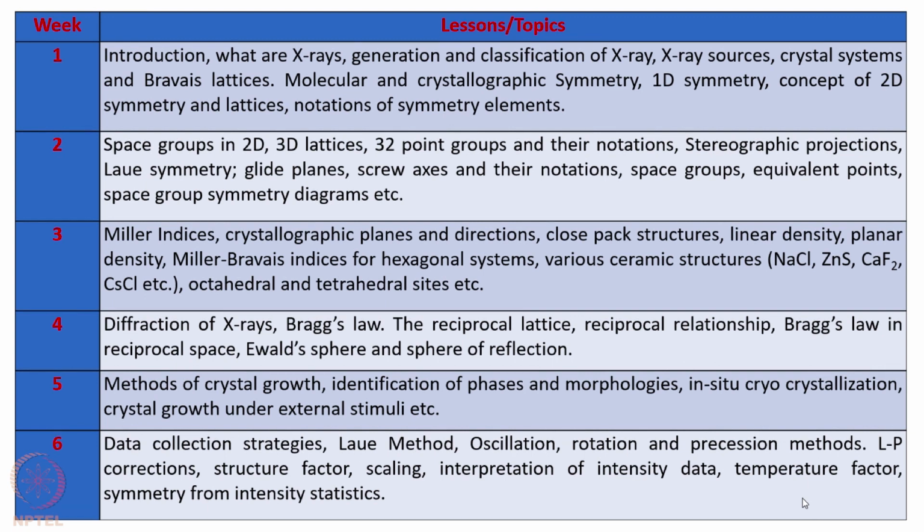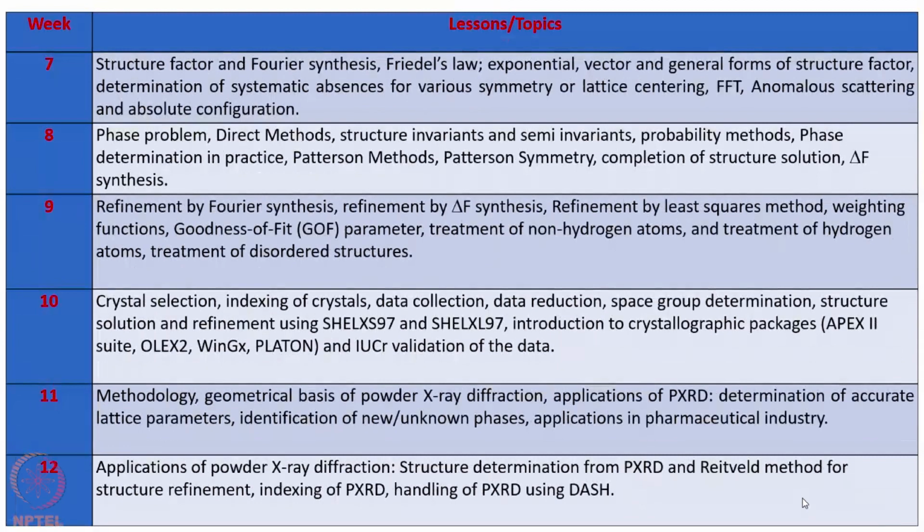Then we will talk about data collection strategies, the Laue method, oscillation method, rotation and all that, and then we will discuss modern-day data collection procedures. Then we will talk about the structure factor, Fourier synthesis, Friedel's law and things like that, to give you an input about how to go about understanding the structure solution from a given data.